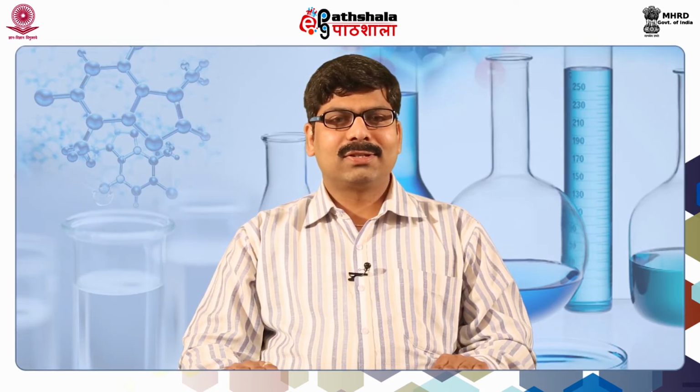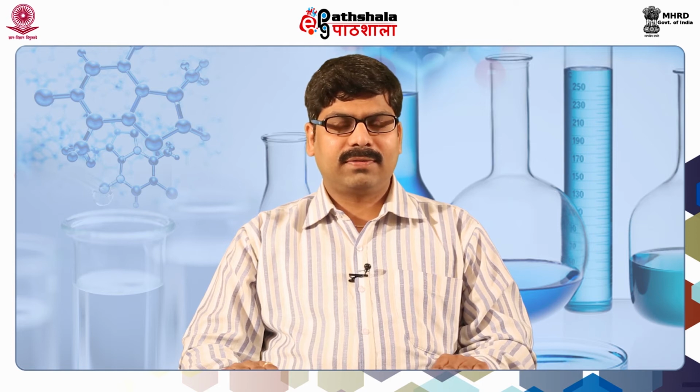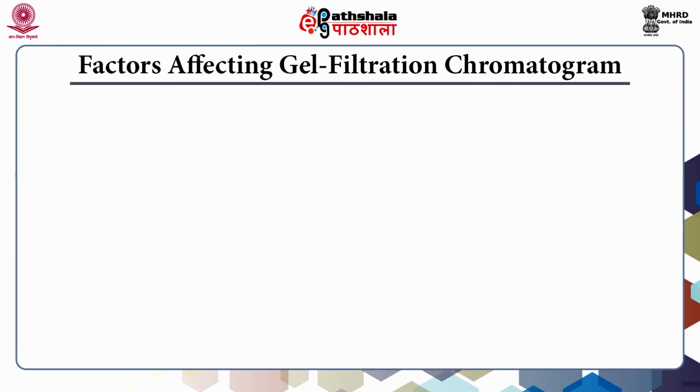Dear students, so far we have understood the basic concept and principle of gel filtration chromatography, as well as the concept of exclusion limit and the gel filtration chromatogram. Now we are going to discuss the factors affecting the gel filtration chromatogram, sample preparation and the applications of gel filtration chromatography. Here we are going to discuss the factors affecting the gel filtration chromatogram.